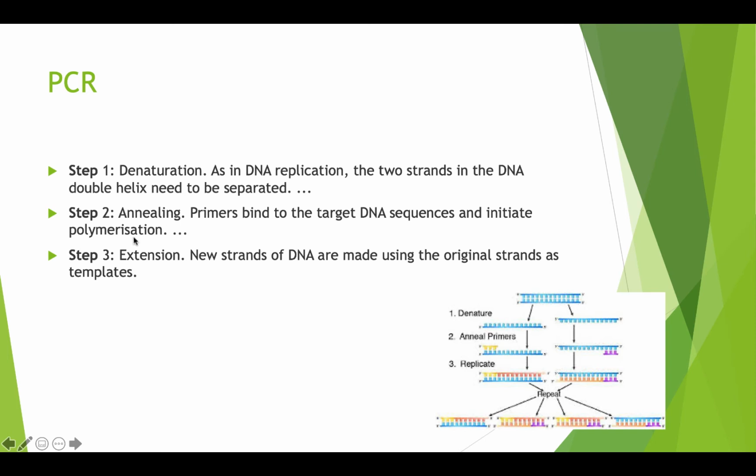You lower the temperature, not a little, you lower it a lot. That allows, for example, 55, where here it was 95. You have to calculate the primer binding temperature. What is the temperature that your primers that you design, that you're trying to use for the PCR, what is the temperature that is best for them?